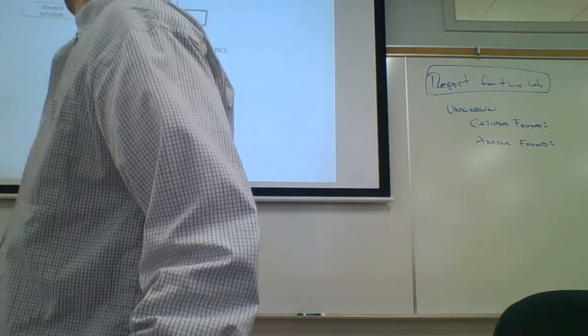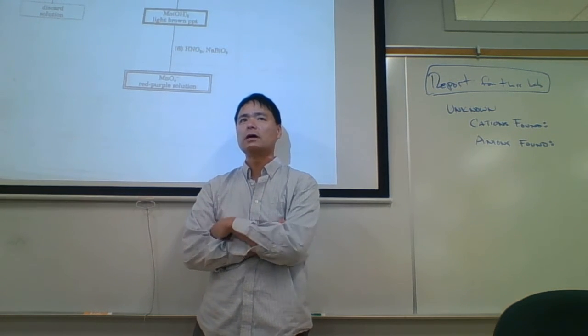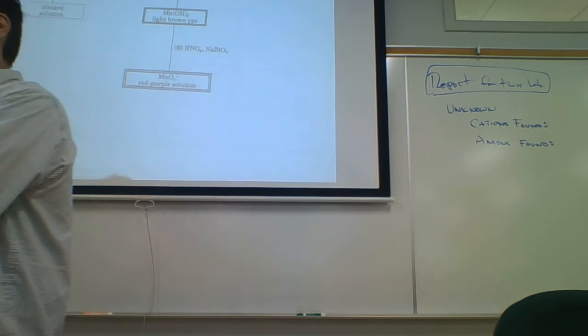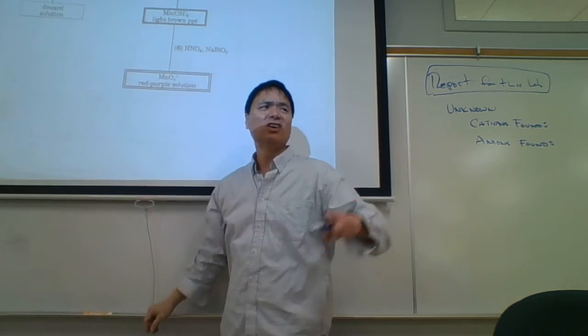Yeah, well, most of the stuff is toxic, but this one is also quite dangerous because it's powerful. I told you not to generate a dust cloud of this because your lungs might start to fill up with fluid. It's a powerful oxidizer. In fact, this stuff I'm going to put in the hood over there.